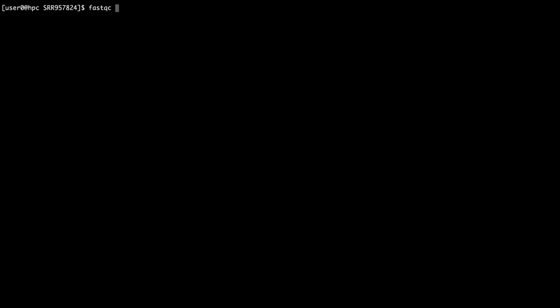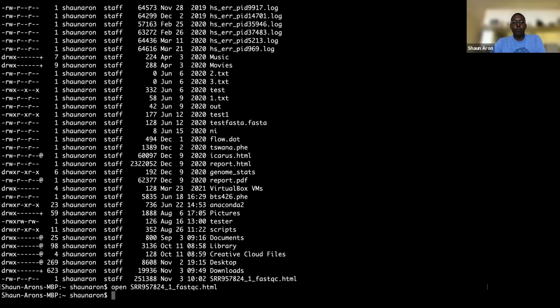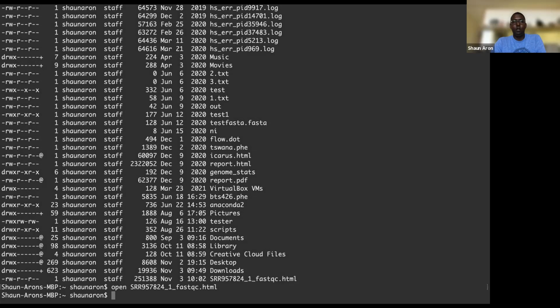like I showed you. So let me just put that command up again. So it's the other terminal. So if you need to copy it to your computer, you need to open up another terminal, and you need to be on your computer.